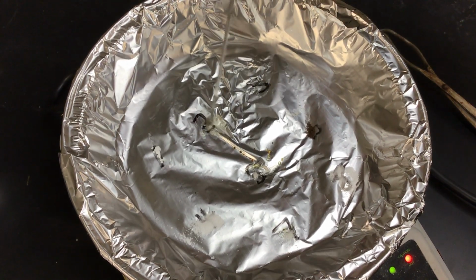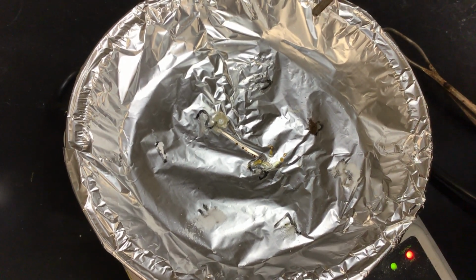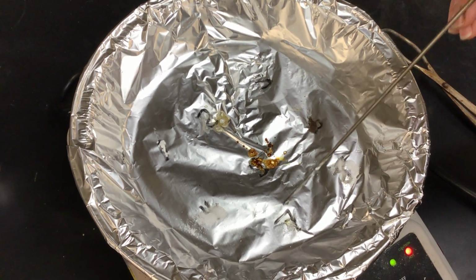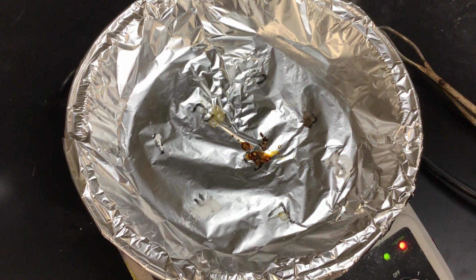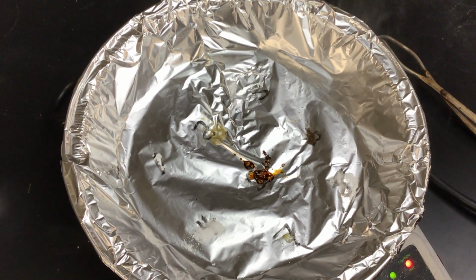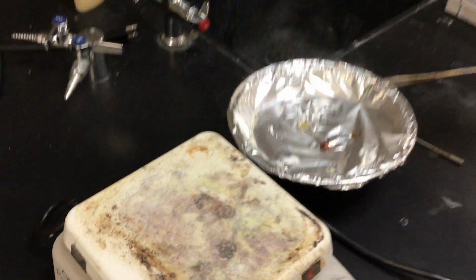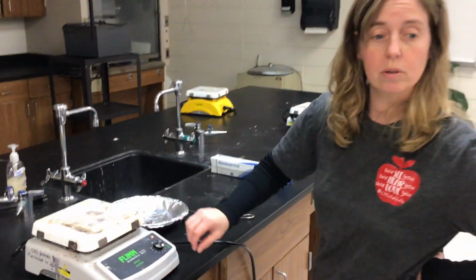All right, number 2 is completely melted. Number 3, then number 2. Number 5 has melted. And number 7 is starting to melt. But as you can see, 1, nothing. 4, nothing. 8, nothing. So we can pretty much assume that those are not going to melt under these conditions, okay? So in your data table, you will put an N for did not melt, okay?